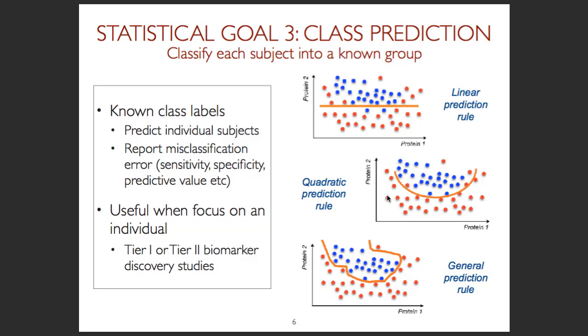And what we will actually emphasize at the end of the 2.5 days is that the number of biological replicates which is needed for this type of thing is a lot more than what many people think. So you really need a fairly large sample size. And actually, if you are staying for the end of this week, there will be quite a bit of discussion with Rudy Ebersold and Mike McCoss about the technological advances of how to also increase throughput in terms of both analytes and samples. So we'll get back to the technology of that at the end of the week.